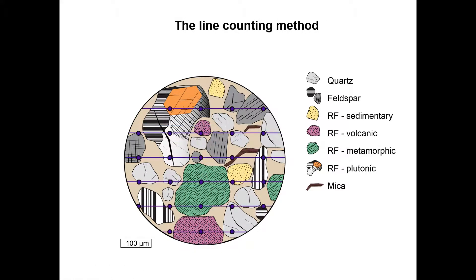Another method is the line counting method. Here you define several lines within your thin section. Then you move your thin section laterally, always using the same step length and count the grain under the crosshairs. The chosen step length again depends on the grain size of your sample.